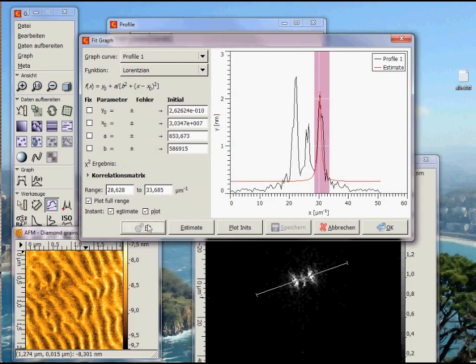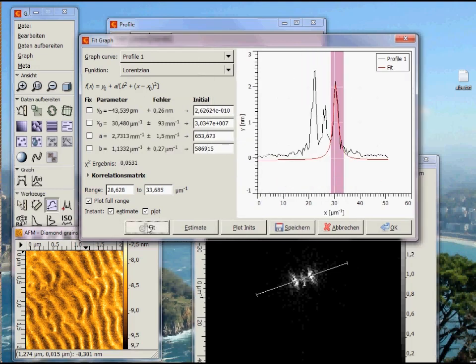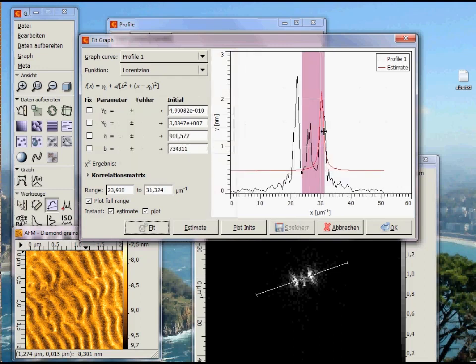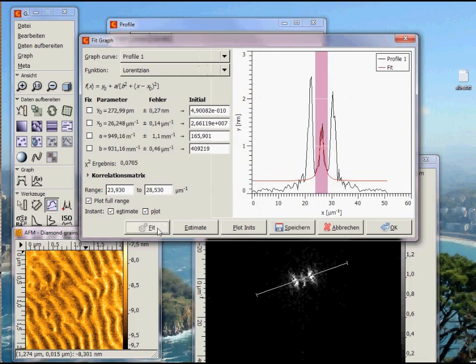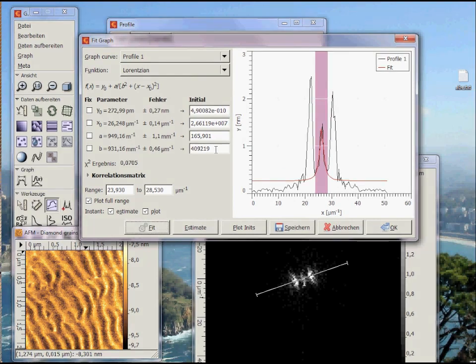The second peak gives us 30.48 per micron with this error. We can calculate the separation to be 8.37 per micron. Taking the reciprocal value gives 120 nm.